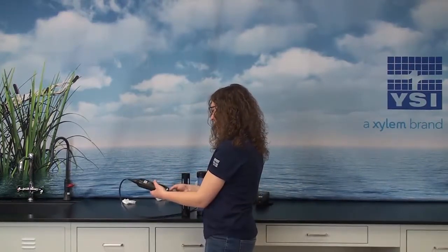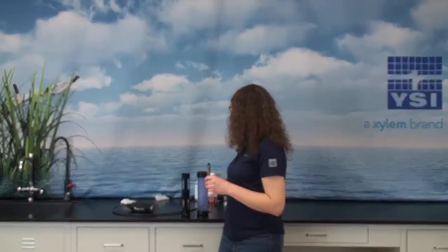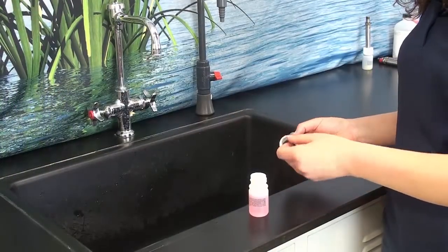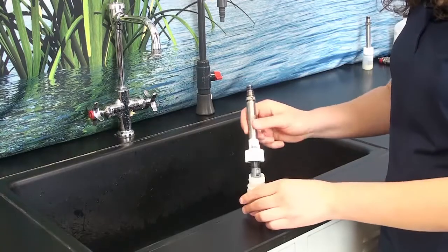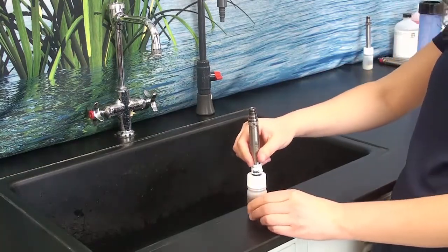Next is pH and ORP. This probe should always be removed from the cable. For long-term storage, we will place this in a container filled with pH buffer 4. This will ensure that the probe remains hydrated during the long-term storage period. This bottle is shipped with the probe, so it's important to keep it after you start using the probe.